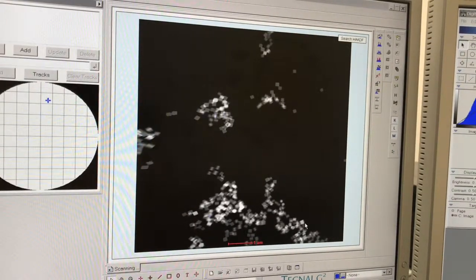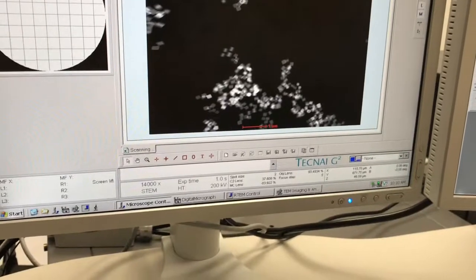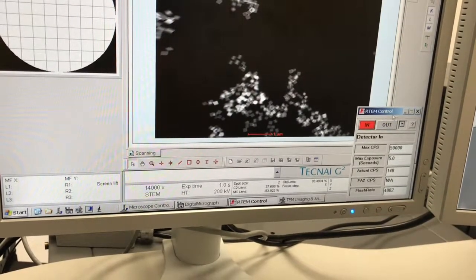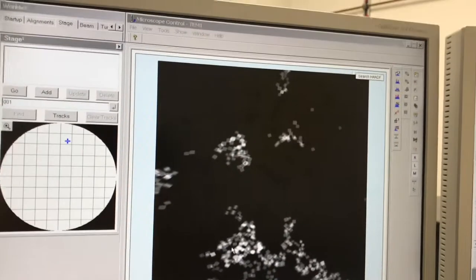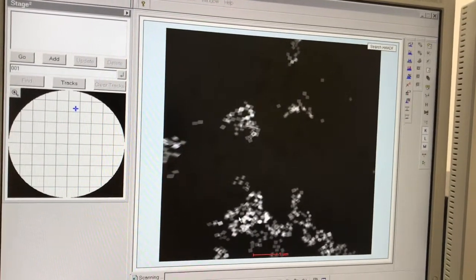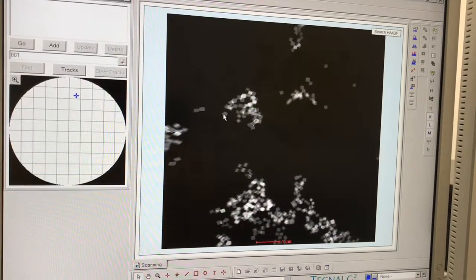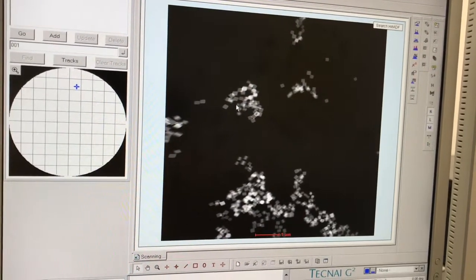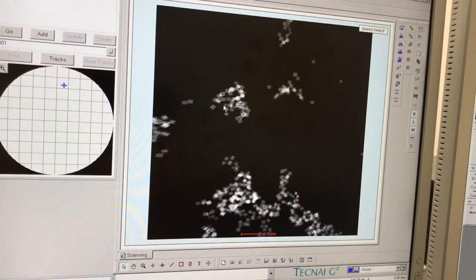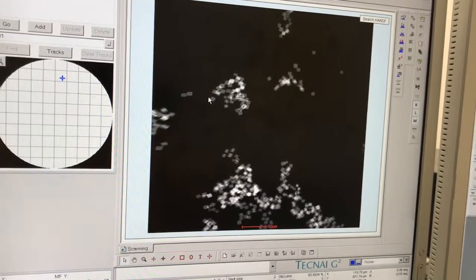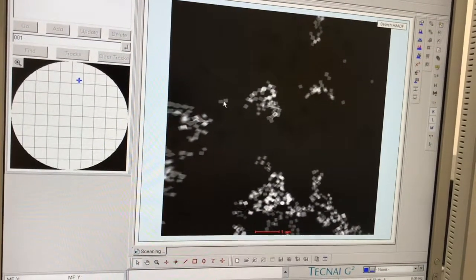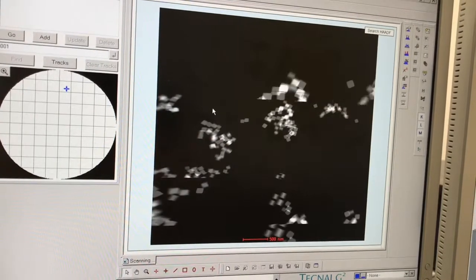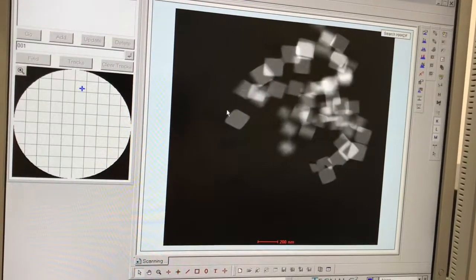This is my live HA-ADF STEM image, so I need to come down here to RTEM control and insert my detector — you can hear the sound as the detector goes in. Now we have some particles that are isolated. You always want to try to find one that's isolated, which isn't always easy depending on how much the particles cluster. Let's take a look at this one right here. I'll use the stage to move it to the middle, increase magnification, and hopefully we'll be able to see this core-shell structure.